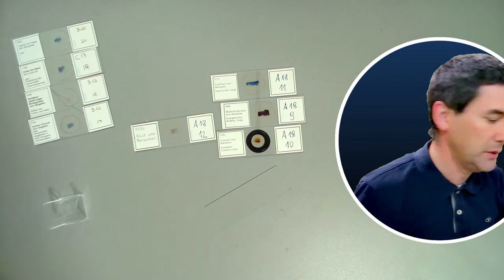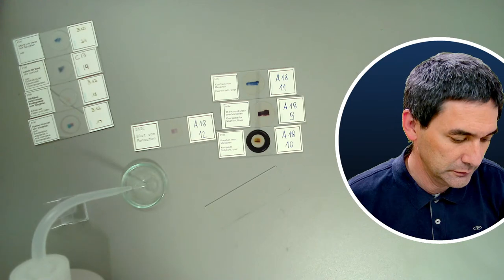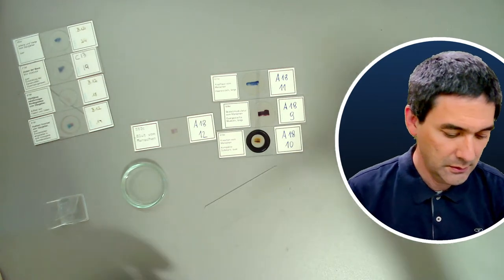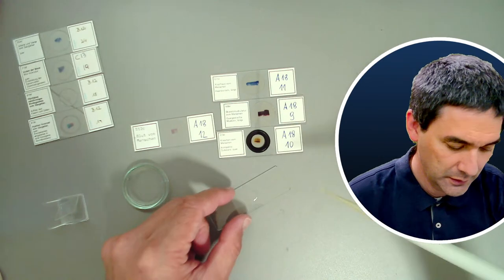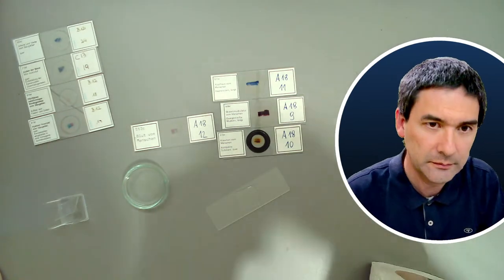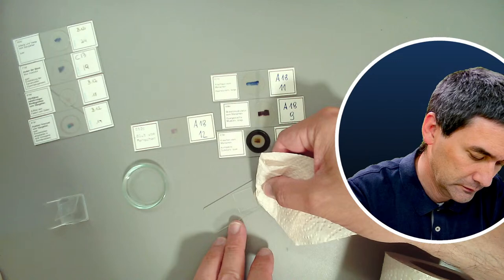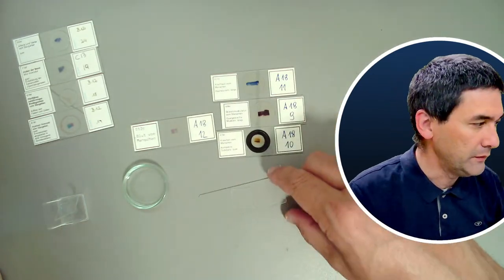So I'm going to put a little bit of water in the dish here. Then over here, I have somewhere my pipette. Here it is. You take a little bit of the water on here. The cover glass goes on top. Excess liquid should always be removed. And let's have a look again, okay?